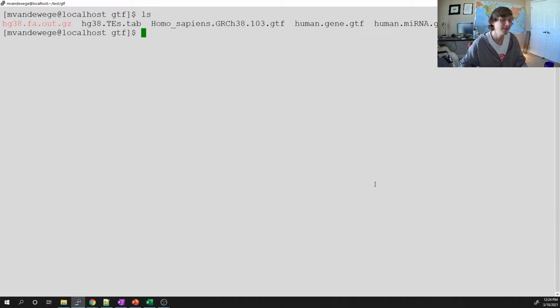Okay, so again, the nice thing about intersect is we can read one file, read another file, and find where annotations overlap and print that out. So for example, whenever I'm doing intersectBed, we have to call the two files with -a and -b. This is in the manual, but I'm just going to briefly go over it. Whatever file you list for B is going to be read into memory. Now we really haven't talked about all the parts of a computer. But you have a hard drive, your memory, a motherboard, and your processors. There's also a graphical processor, but that's generally about it. Your hard drive and your memory.